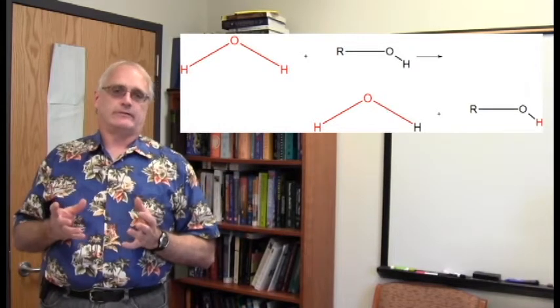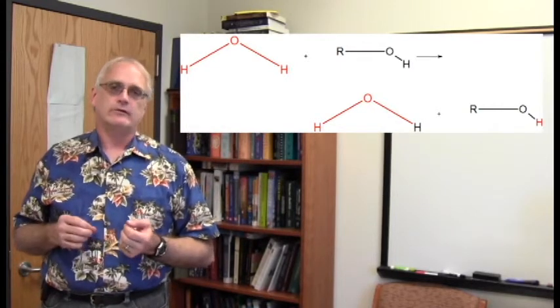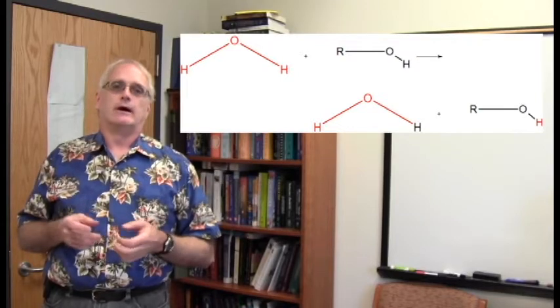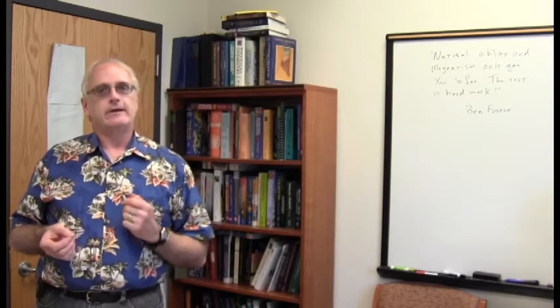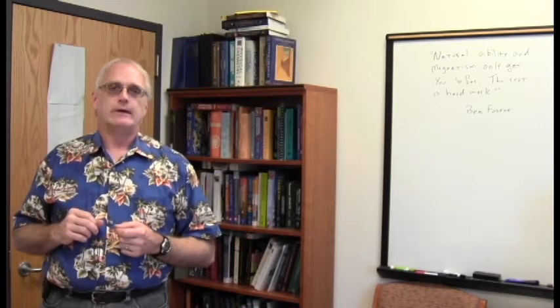To take advantage of this and try to prove a resonance in a proton NMR spectrum is from a hydrogen on an oxygen or even on a nitrogen, one thing you can do is the D2O drop test. Take your NMR tube after you've run the spectrum, pull it out of the magnet, add a drop of D2O, just one, cap it back up and give it a couple of good shakes.